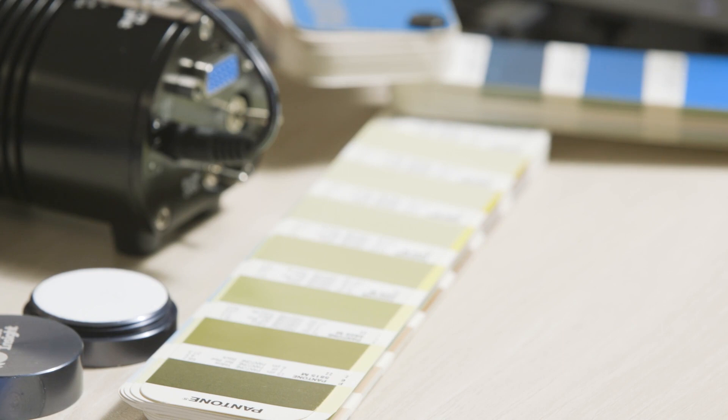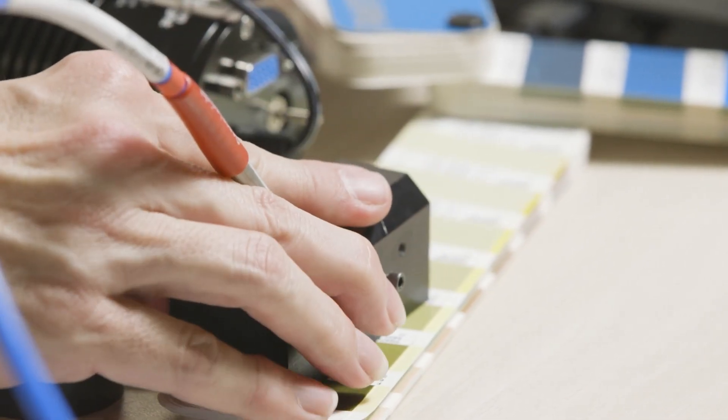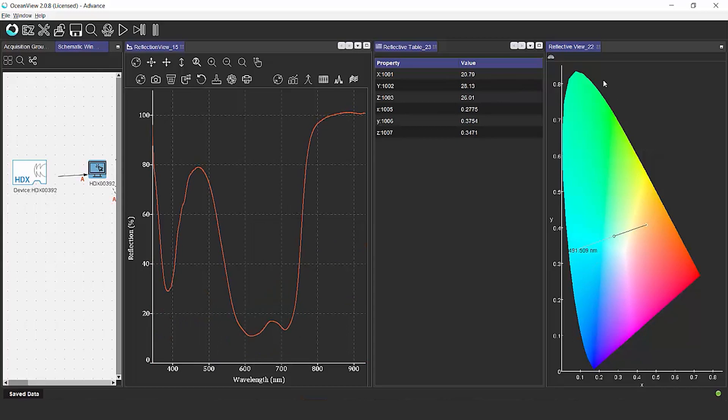As we change to a different color, again, we can see how the chromaticity diagram is reflecting the color that we're actually measuring.